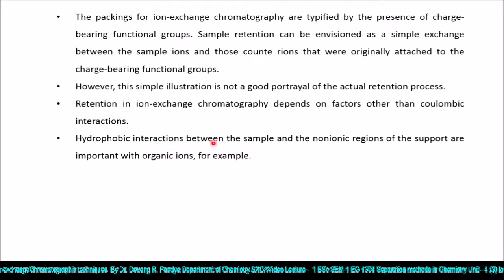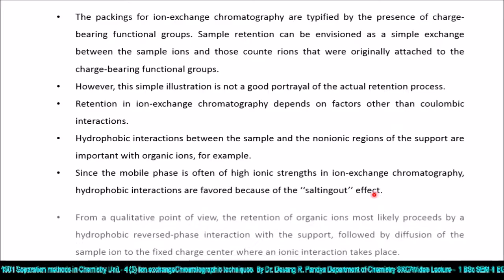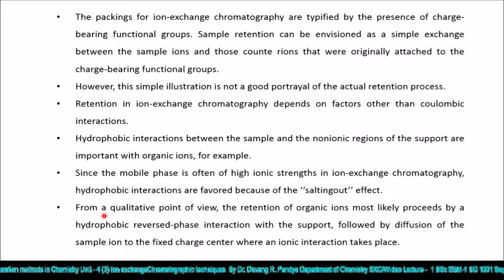Hydrophobic interactions between the sample and non-ionic regions of the support are important with organic ions. For example, since the mobile phase is often of high ionic strength in ion exchange chromatography, hydrophobic interactions are favored because of the salting out effect.